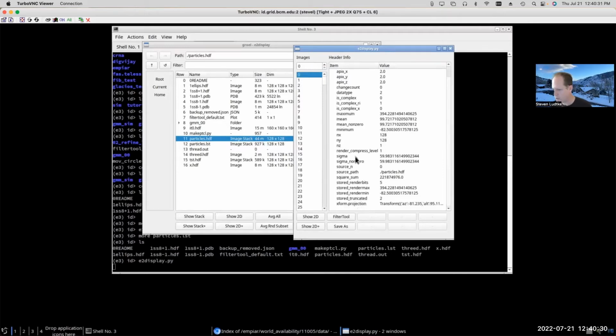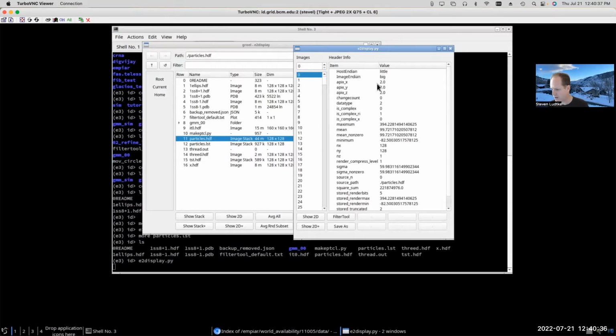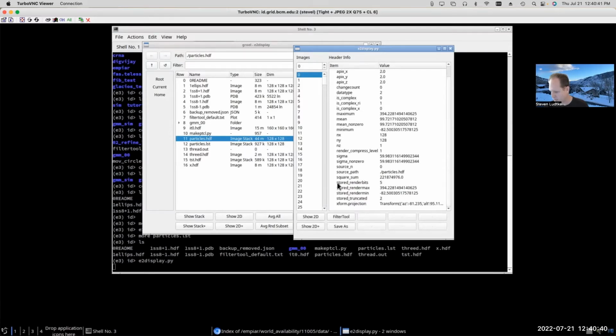So here's all the header data stored about that particle. And it includes sort of standard parameters up here. You can see that this data was actually compressed. These render bits, render max, render min, truncated. This stuff is all associated with that paper that I passed around in talking about how many bits were preserved in the header of the data.